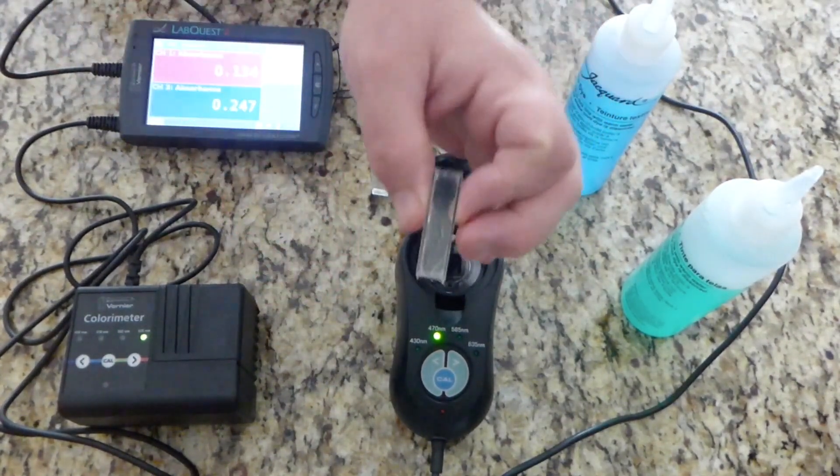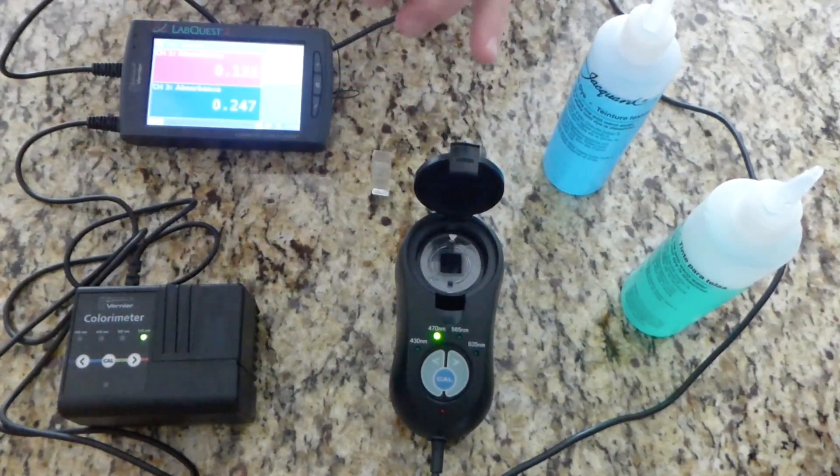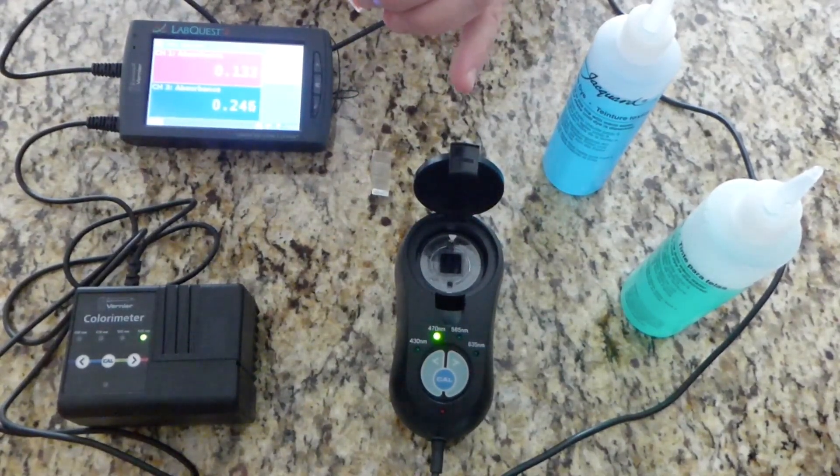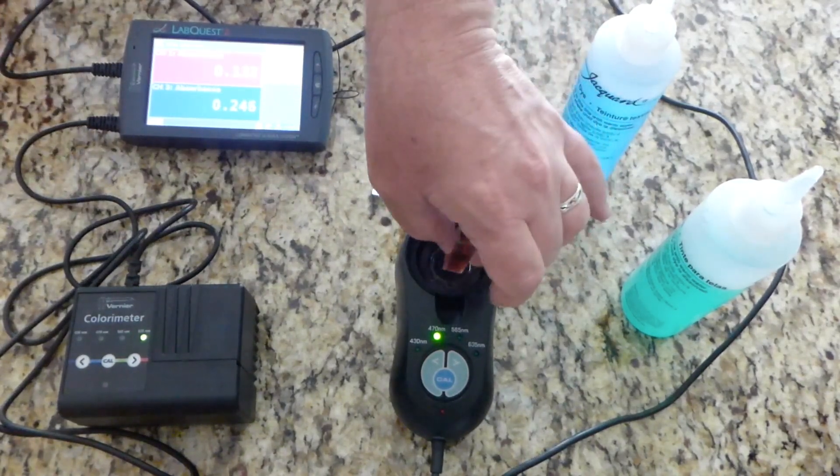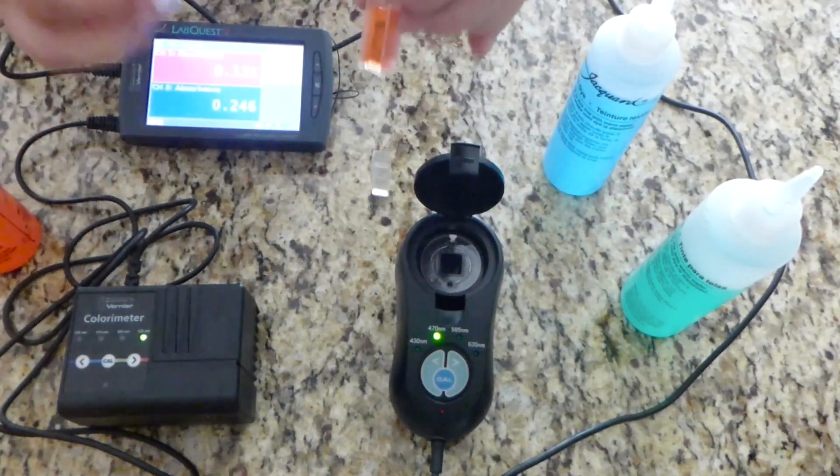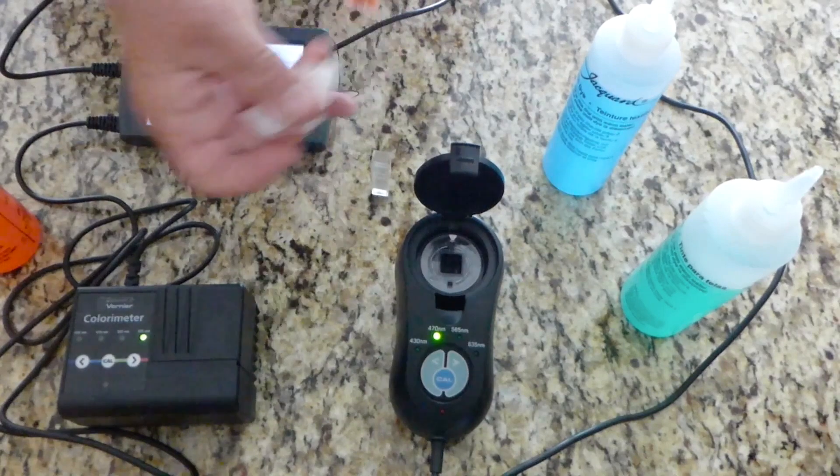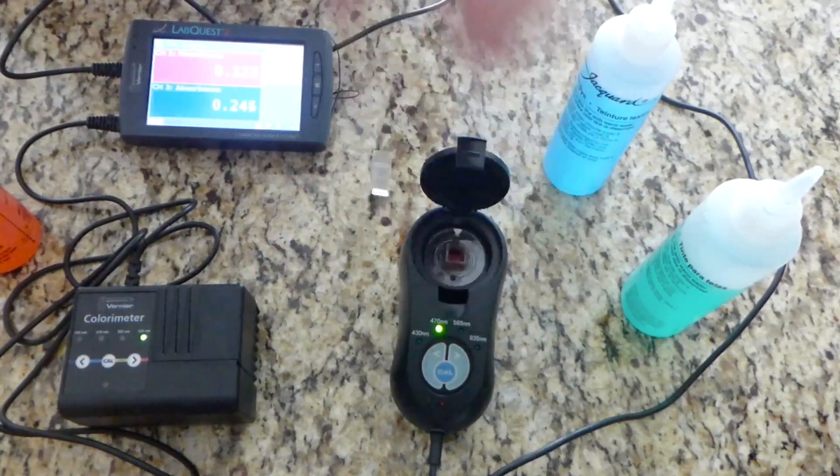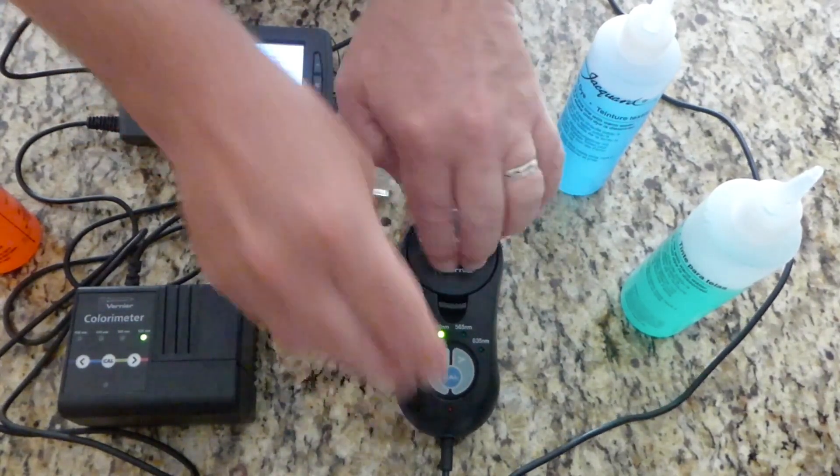Here's a red solution. I'm going to pour it in the cuvette. Make sure that it's aligned in the correct way. Wipe it off, then align it in the correct way. Close the lid and take a reading at this new wavelength.